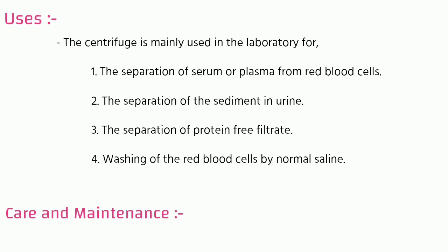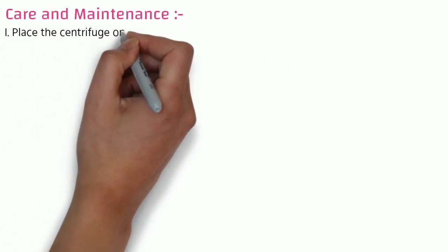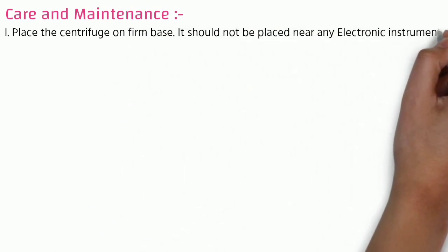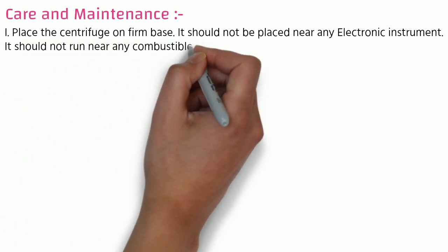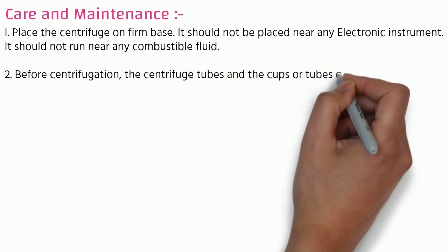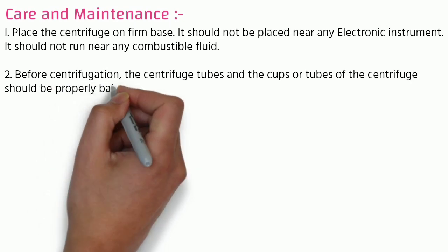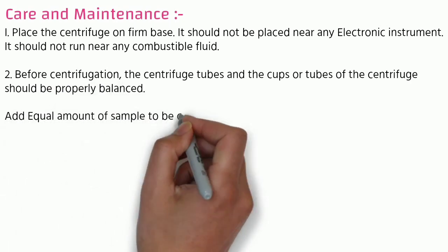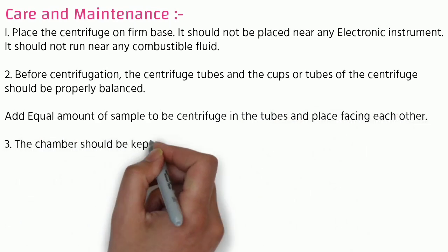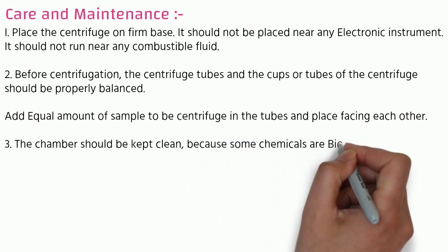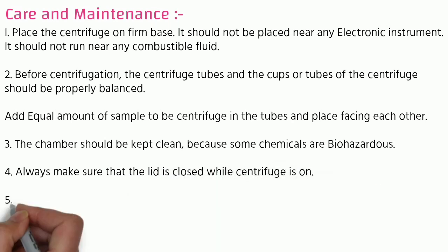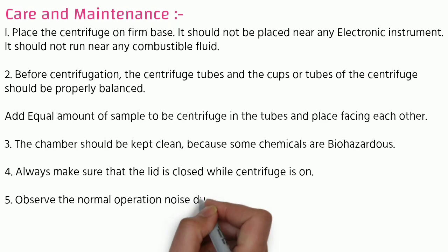For care and maintenance of the centrifuge: place the centrifuge on a firm base; it should not be placed near any electronic instruments; it should not run near any combustible fluid. Before centrifugation, the centrifuge tubes and cups should be properly balanced — add equal amounts of sample to tubes and place them facing each other. The chamber should be kept clean because some chemicals are biohazardous. Always make sure the lid is closed while the centrifuge is on.